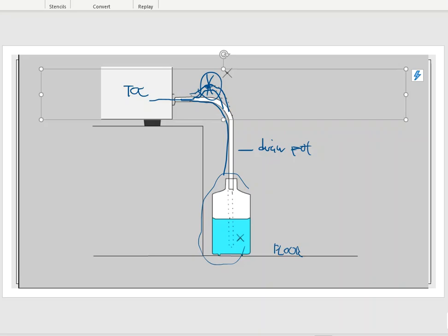We don't want it to back up and get stopped up because you're having some kind of kinky hose in the lab. So just pay attention to it. Make sure that you are just double checking some of the tubing and some of the drain lines whenever you go over and use the instrument, so that way this does not happen on you.